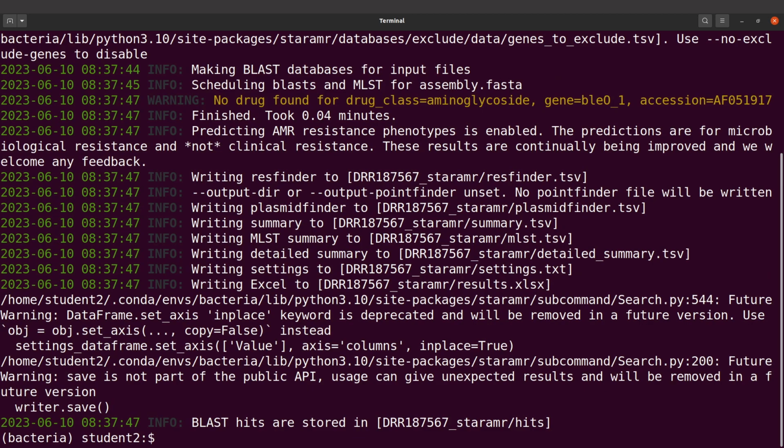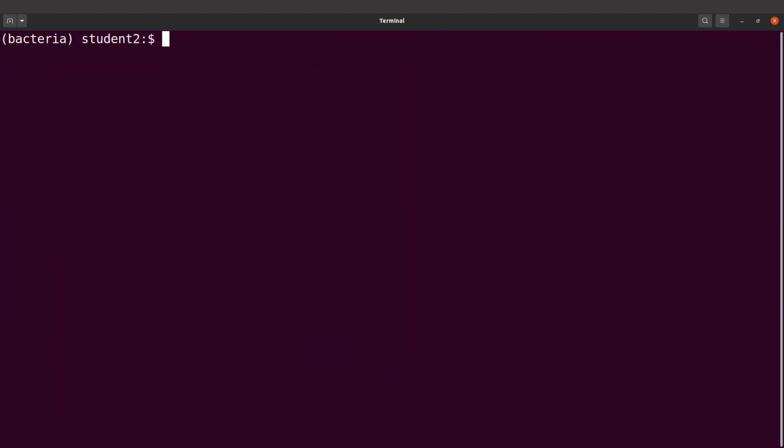All right, so everything has been done. With this one, you can ignore it. That's fine. It's nothing to get worried about. Okay, so we have been able to successfully execute STARAMR. I repeat, we have been able to successfully execute STARAMR. So we have the outputs. Let's take a look at them.